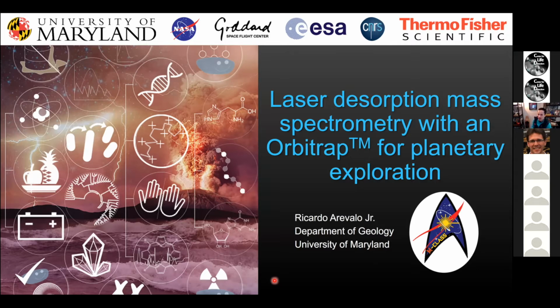It's worth going into the acronym because that's what I'm super interested in, and a lot of what we do in my lab is laser processing and mass spectrometry. Today I'm going to talk to you about probably our biggest research line in the M-Class lab, which is interfacing an Orbitrap mass analyzer with a laser desorption system.